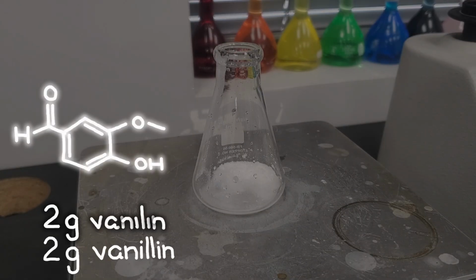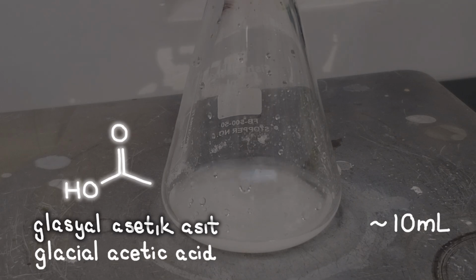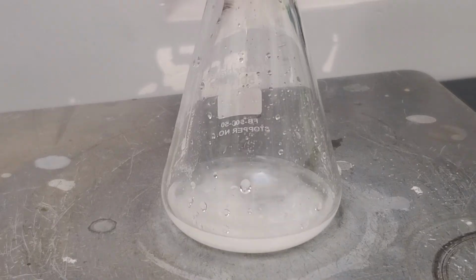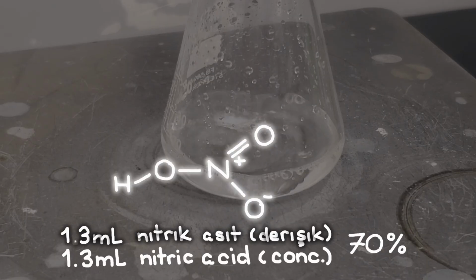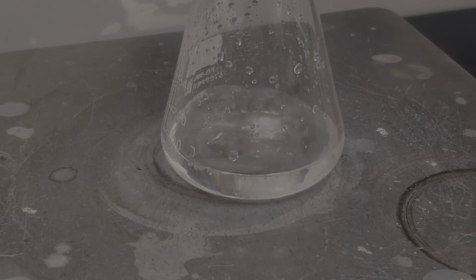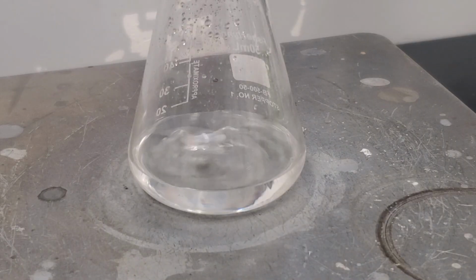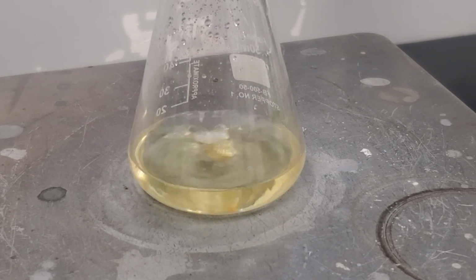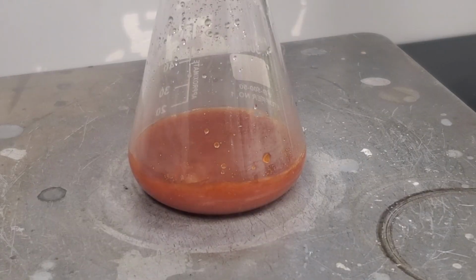I dissolved 2 grams of vanillin in a minimum of cold glacial acetic acid, about 10 ml. Once everything was in solution, I added cold concentrated nitric acid dropwise with good stirring, keeping the temperature down. After the addition was complete, I let the mixture stir at room temperature for 30 minutes. To help precipitation, I then added some cold water, which gave a much cleaner yellow-orange solid compared to the first run.